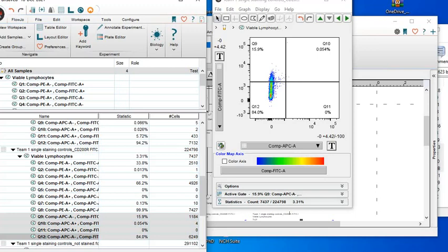If you're following, getting FlowJo is quite easy. You can go online to download FlowJo. You have the trial version, and you can also pay for it once you have your statistical analysis. There's really no need for you to hand over analyzing your FlowJo data to someone else. You can typically do it yourself, looking at these cells when you have analyzed your samples using the flow cytometer. The flow cytometer is very dynamic and gives you accurate results, whatever cells you are dealing with, cell lines, cultured cells, immunological cells, whatever it is, the flow cytometer can analyze it.